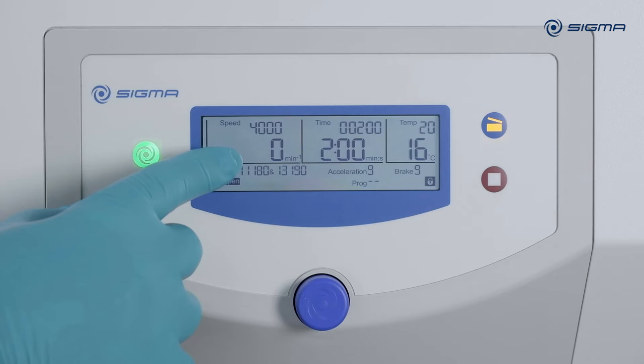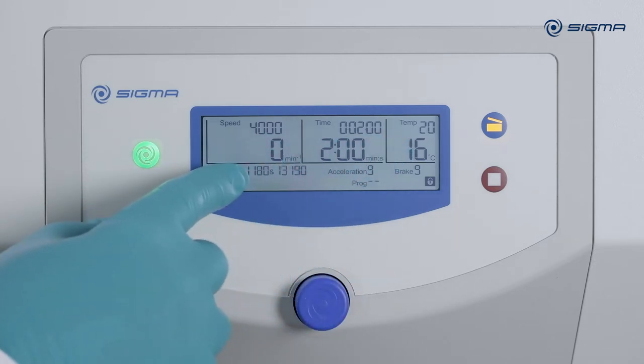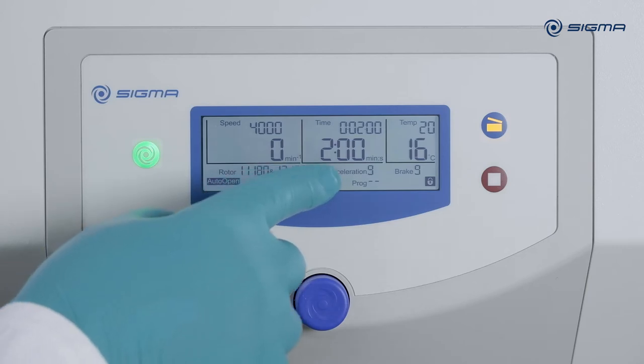All preselected values are shown on the display: target and actual values, speed or RCF, runtime, temperature, rotor and bucket combination, acceleration and braking curves, and optionally a program.